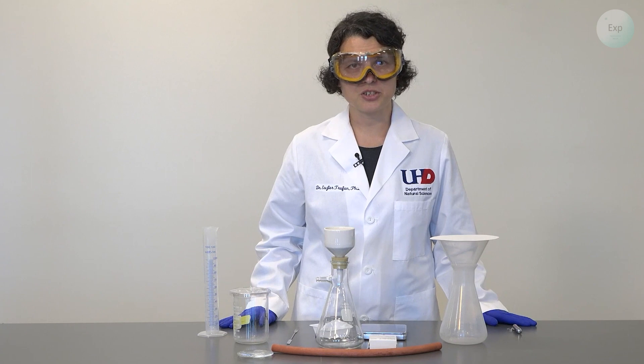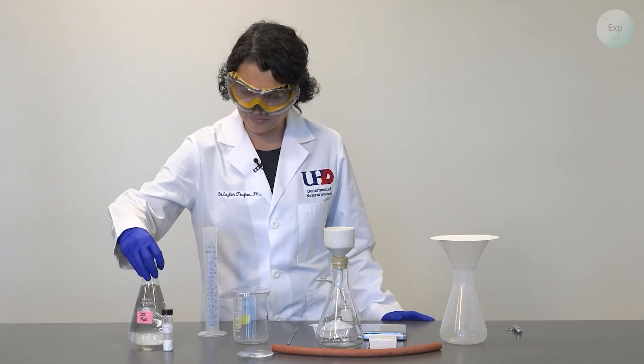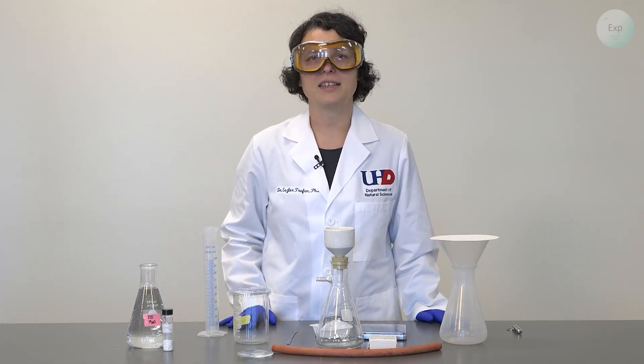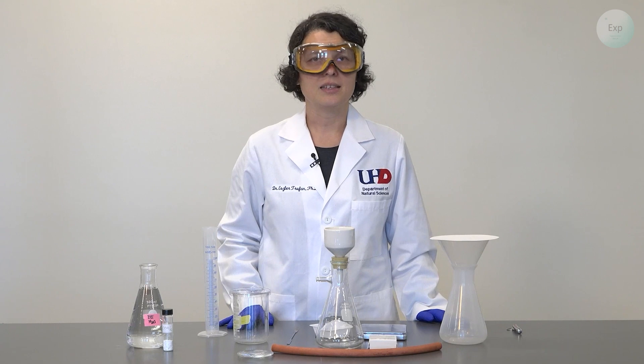For our materials, we're going to need a lot less. We're going to use some calcium hydroxide and some deionized water. If you do not have calcium hydroxide easily available to you, then you can make it from the precipitation reaction between calcium chloride and sodium hydroxide.